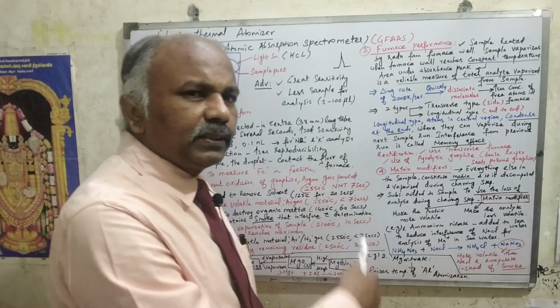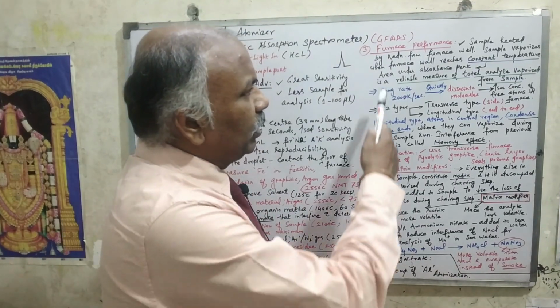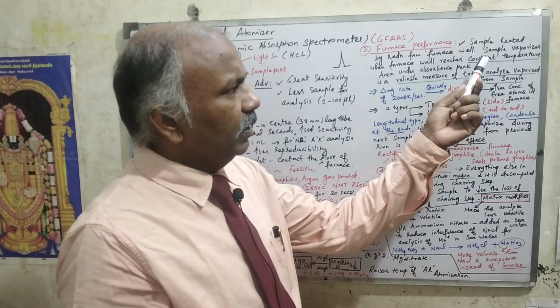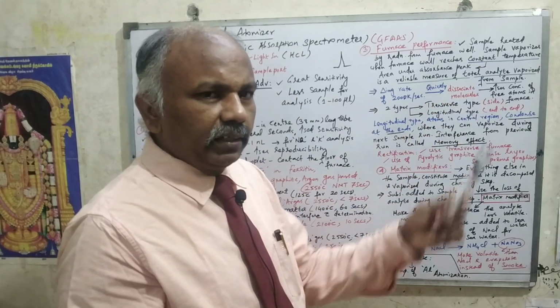Now coming to the furnace performance, how the furnace gives good operation. If you look at it, the sample is heated by radiation from the furnace wall. The sample vaporizes when the furnace wall reaches a constant temperature.